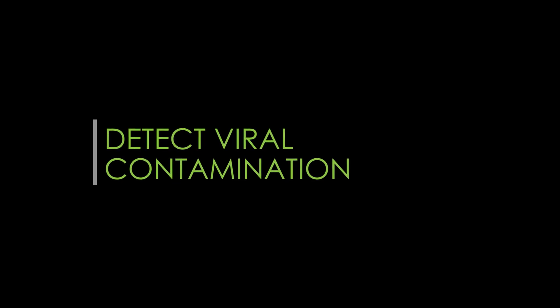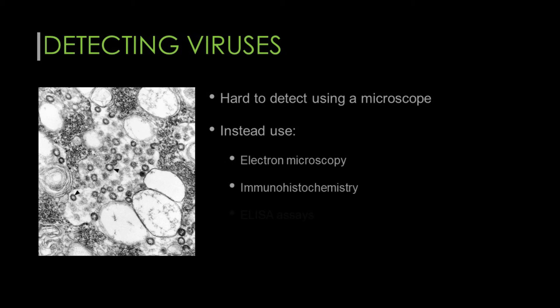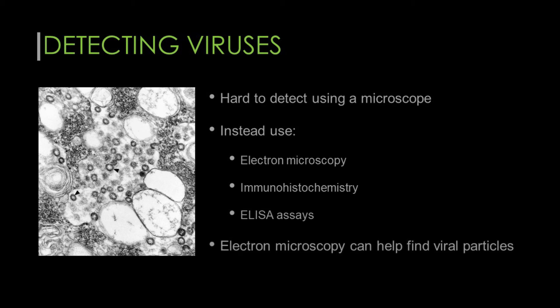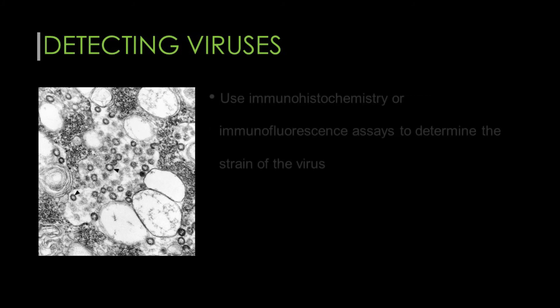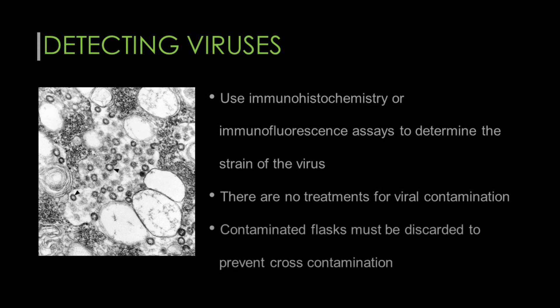How do you detect viral contamination in cell culture? Viral contamination is hard to detect using a regular light microscope, so we recommend using electron microscopy, immunohistochemistry, or ELISA assays instead. A test using electron microscopy is useful to find the presence of viral particles. Further testing using immunohistochemistry or immunofluorescence assays can also help find out more about the strain of the virus. Unfortunately, there are no treatments for viral contamination, so it is hard to recover the contaminated cell lines. Therefore, the contaminated flasks must be discarded to prevent cross-contamination of other cell lines.